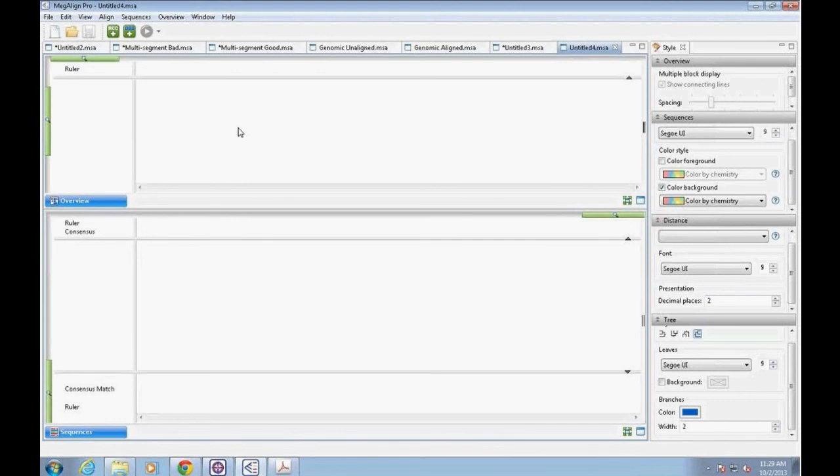Now, there are a few characteristics of these whole genome alignments that cause problems in these other methods. The first thing here is that these whole genomes have a large memory requirement. Second, genomes can be very divergent. Genomes can have a lot of rearrangements, including both large and small insertions, deletions, duplications, and inversions. Some genomes may also have gene clusters or large islands of unique sequences.